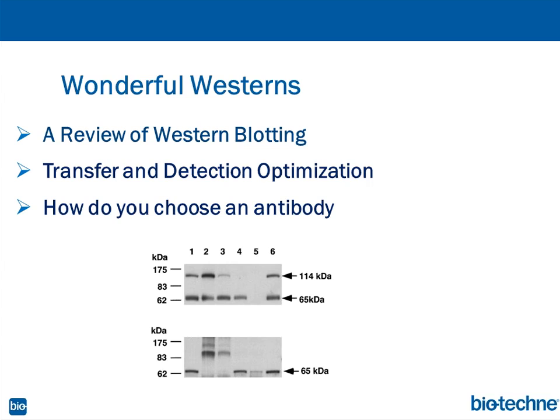So what we're going to do is, you'll have to forgive me for insulting the intelligence of anybody that's been doing Westerns, but we're going to do a quick review because I think it's important to cast a wide net. We're then going to get into transfer and detection optimization specifically, and then we'll have a little bit on choosing an antibody, and then I'll have a few other bits of information.